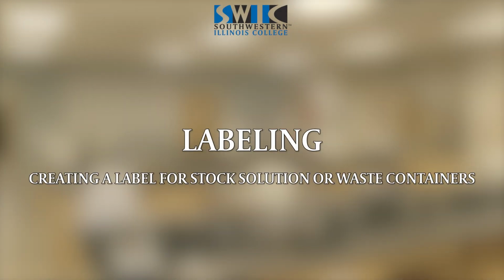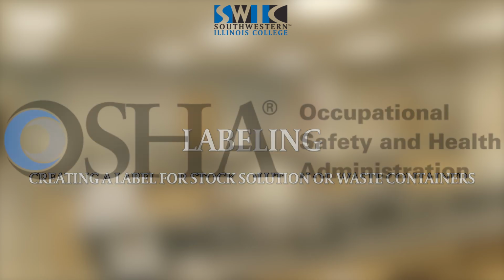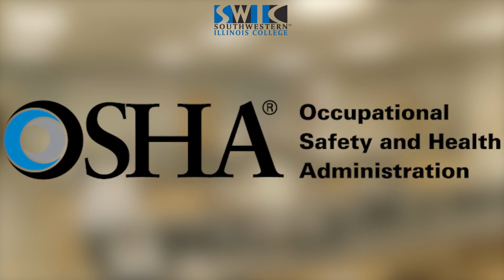When you're creating labels for containers of stock solutions, there are some key things you must include to adhere to the OSHA Hazard Communication Standard. OSHA stands for Occupational Safety and Health Administration.